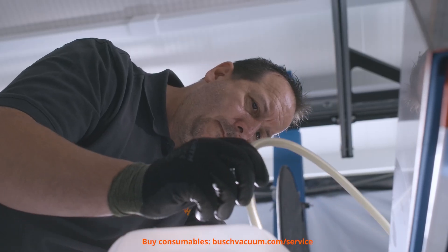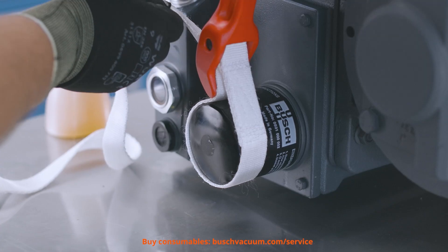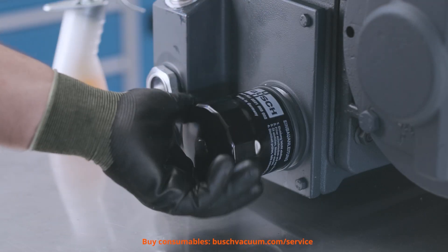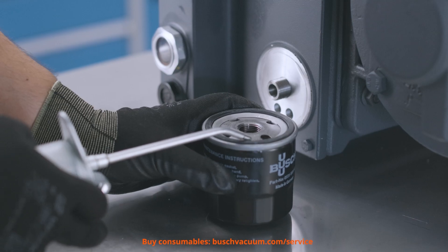We should check the condition and colour of the oil. Now we can replace the oil filter. Make sure to only use genuine Busch filters to get the best results. They have been specially developed to perfectly match R5 vacuum pumps.